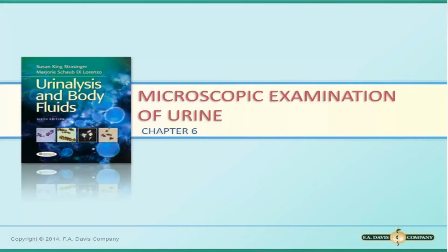Good day, everyone. So for this video lecture, we will be talking about microscopic examination of urine.